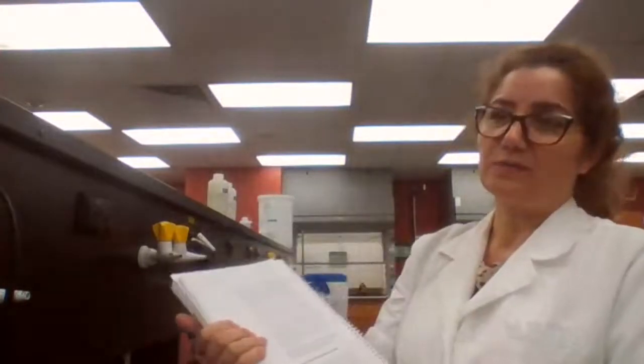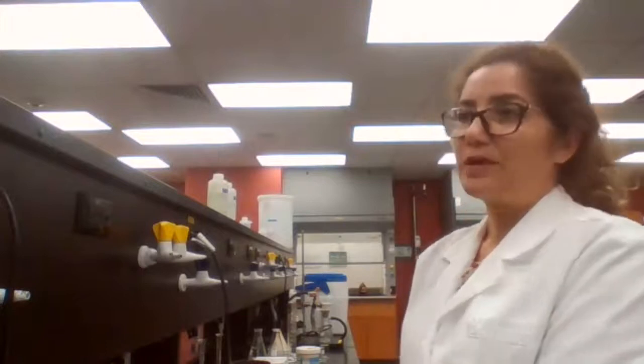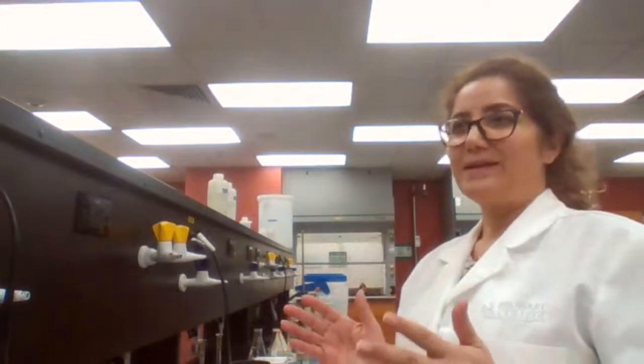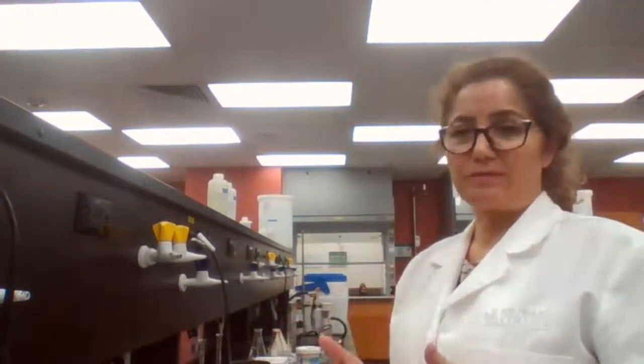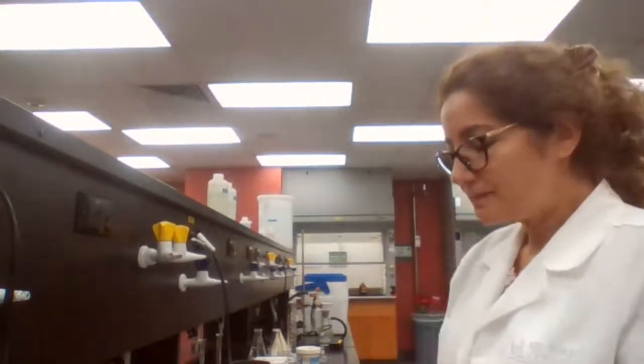Another application would be if your sample is a solid compound, you measure the melting point and you get a broad range of melting. When you have a broad range of melting, that means your compound is not pure. Then you have to purify your sample before you can identify your sample.